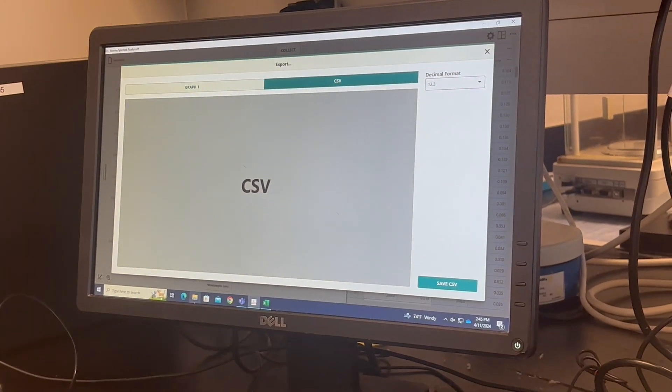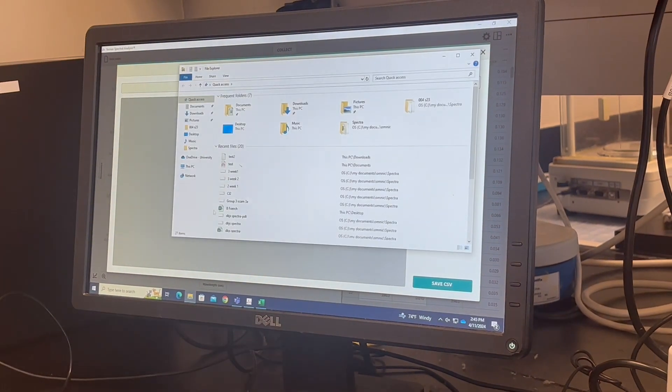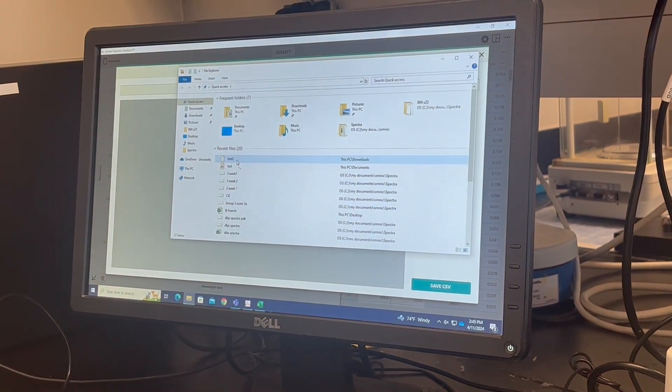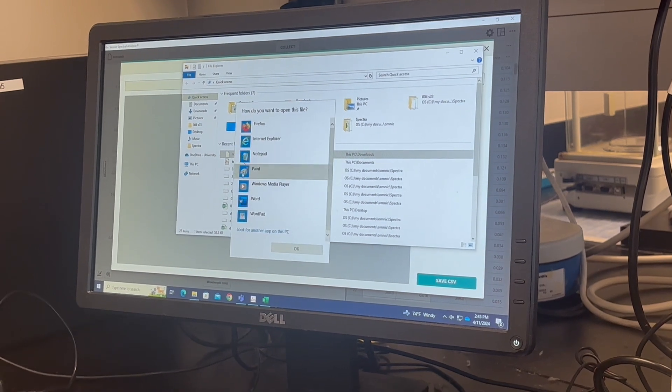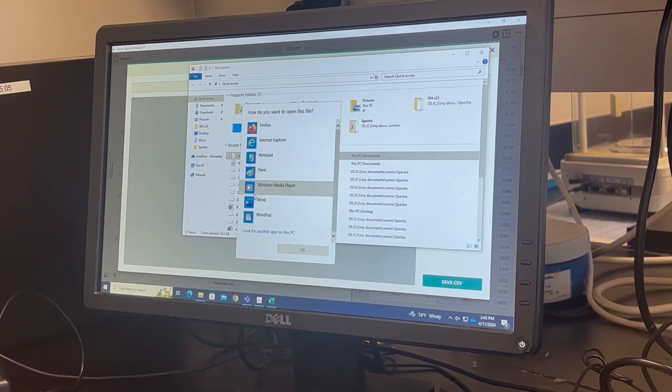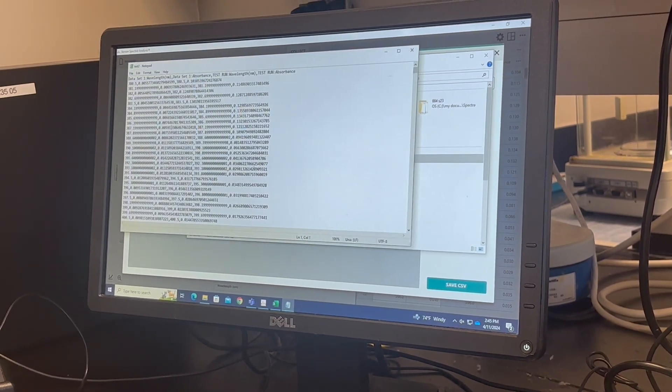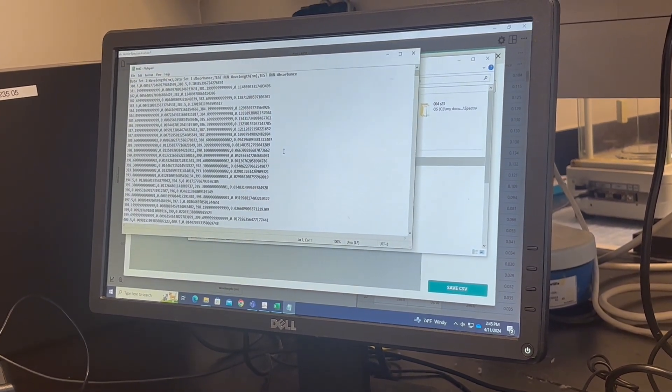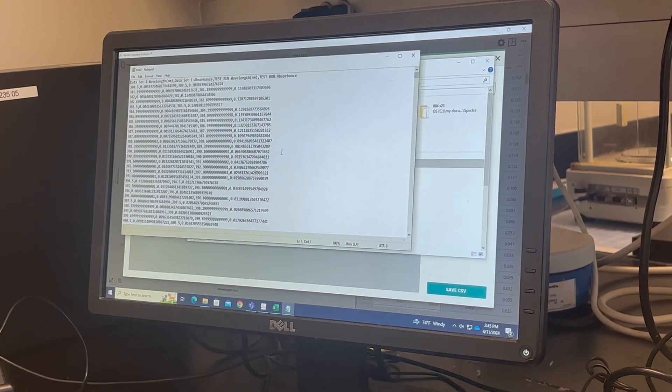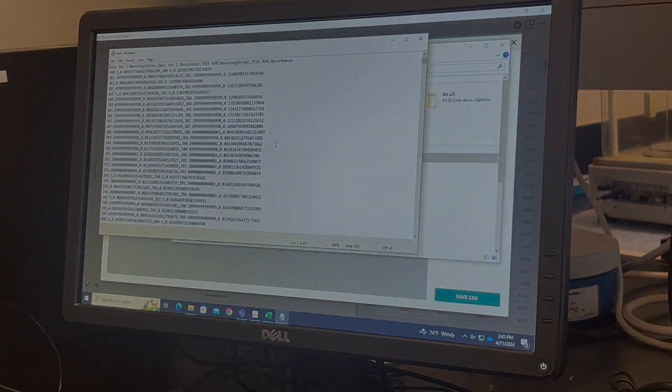And then you can open Notepad. You can open a Notepad and then copy over to Excel.